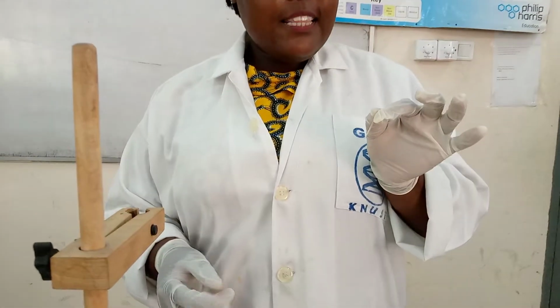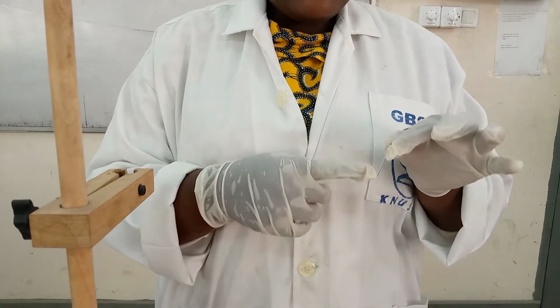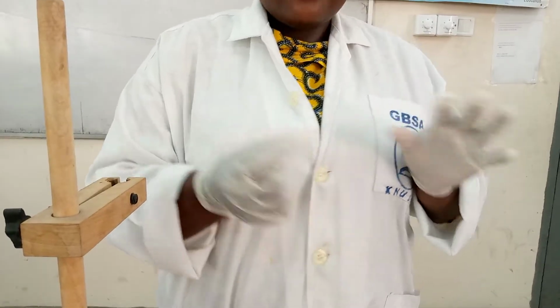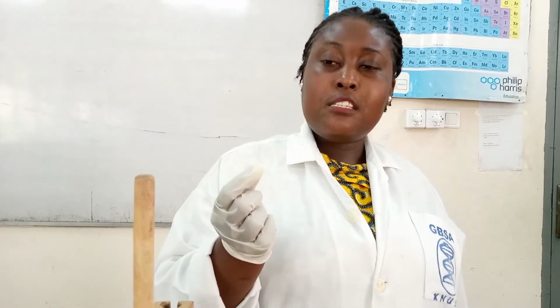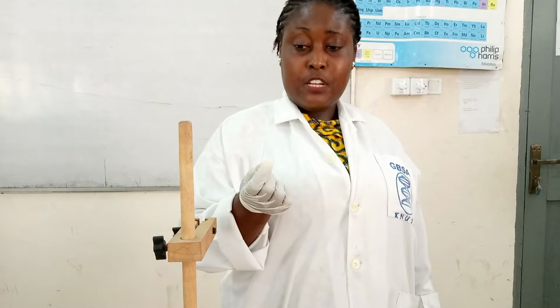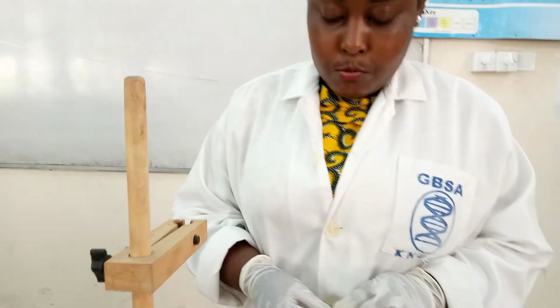You see that it is clear. You would think that there is nothing in it, but the sample, the unknown sample, has melted. So it is colorless. From the beginning, we saw some whitish something in it when I filled it. But after determining its temperature, it is looking like there is nothing in it. Yes, it has melted, so it is colorless, and it is transparent. You can see through. Yes, it's very hot though.